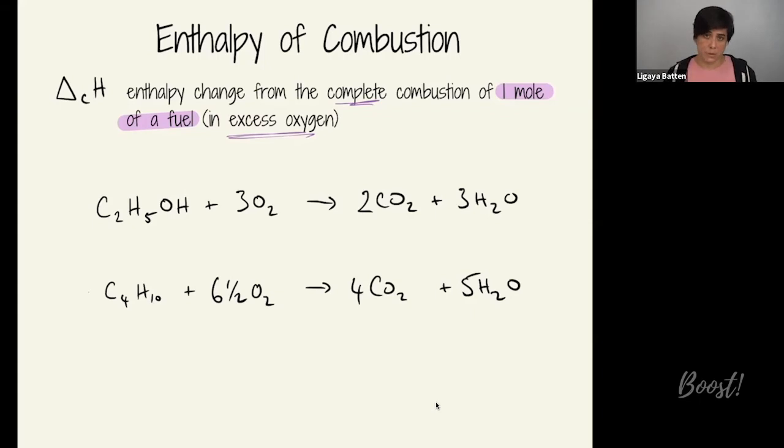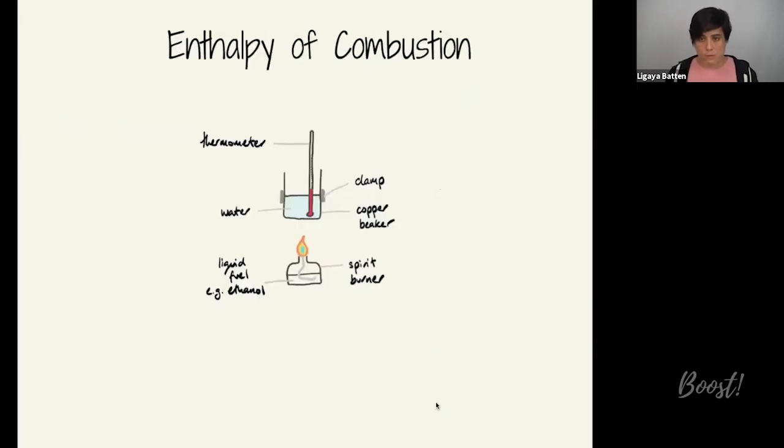Again, similarly to what we did earlier with the enthalpy change of neutralisation, just remember that if you are going to be comparing these values that you measure experimentally to databook values, you would usually be comparing them to standard values, and therefore you want to make sure that your experiment is done as close to standard conditions as possible, 25 degrees centigrade and 1 atmosphere of pressure. For combustion reactions, we don't normally have to think about the concentration of solutions because we're not doing a reaction involving solutions. So this is more or less what our apparatus will look like.